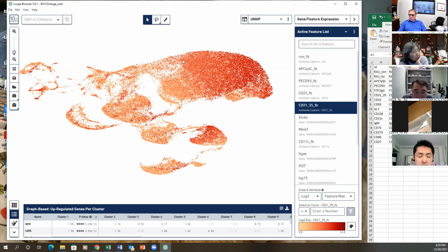So we don't know what this is. Transitional, FO, marginal zone, germinal center, plasma. We don't know what this is. Perhaps with the QC, this will be clearer. There are lots of doublets. There are 10% doublets.